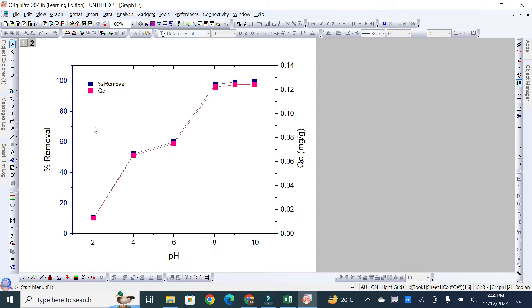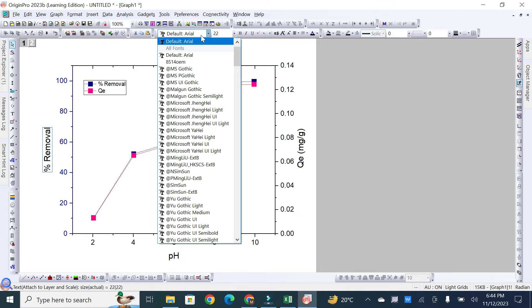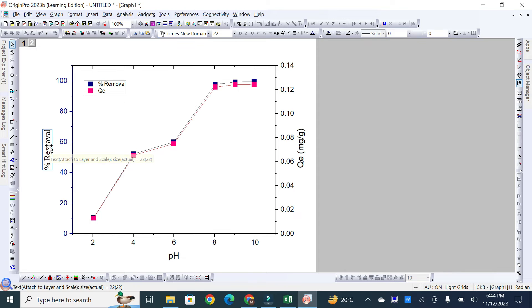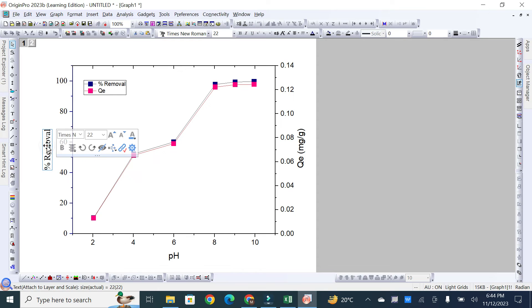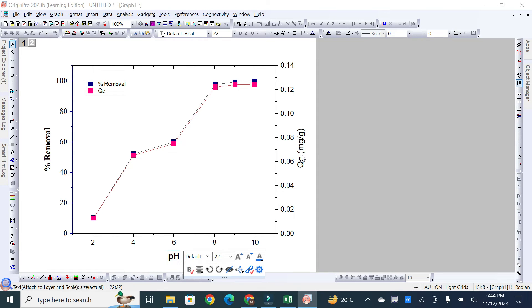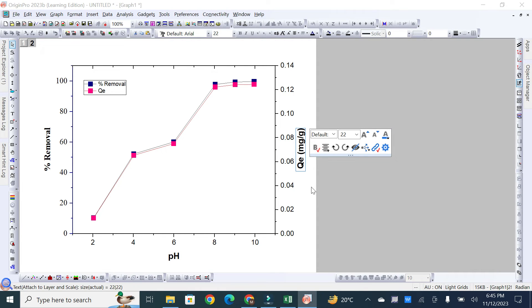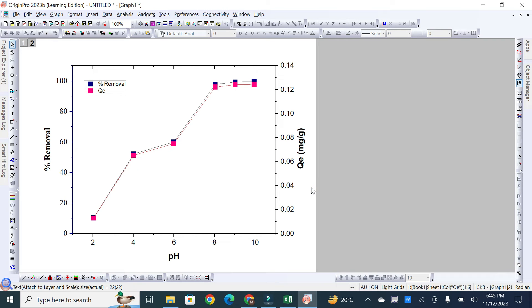To change the font size and font style, click on the axis title and select a font — for example, Times New Roman. The same font is available for axis values, and you can change the font size from the dropdown. You can also change the font color, for example from blue to black. To bold the text, click on B (Bold). In the same manner you can change the font style and color of your axis titles and axis values.